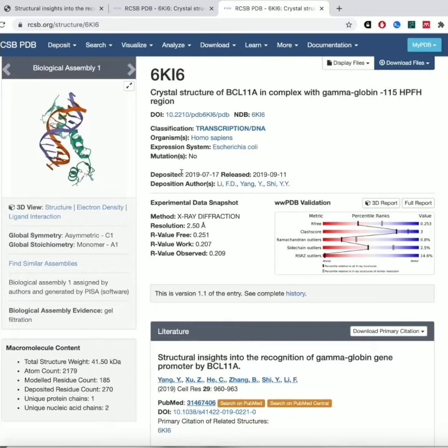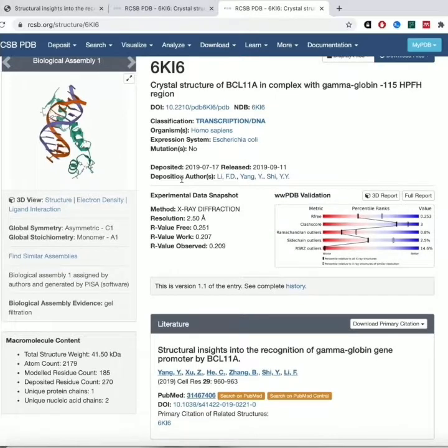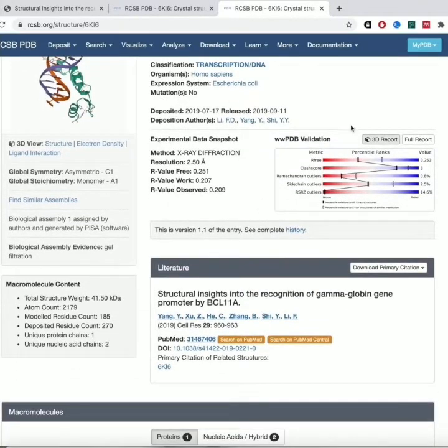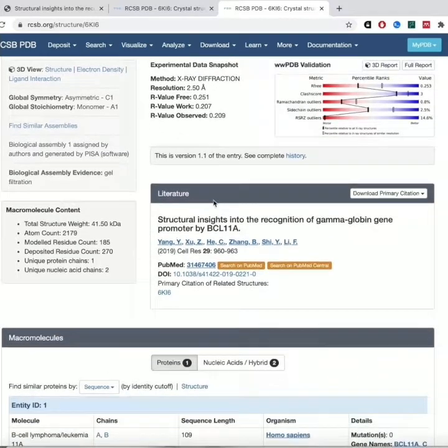It tells you when it was deposited and when it was released. Usually they will deposit the structure before it's released — they deposit it while the article is under review, and then the PDB will hold it until they publish the paper and then release it. You can release data without having a paper, but the authors or journals usually want to hold off on releasing the actual data until the paper is released. It also tells you about the quality of the structure.